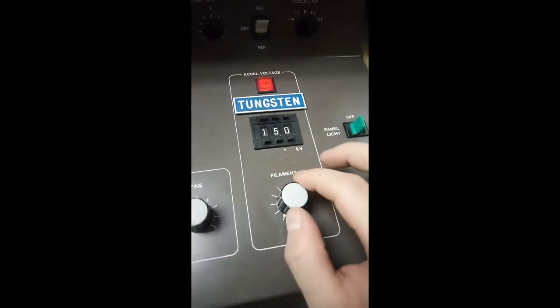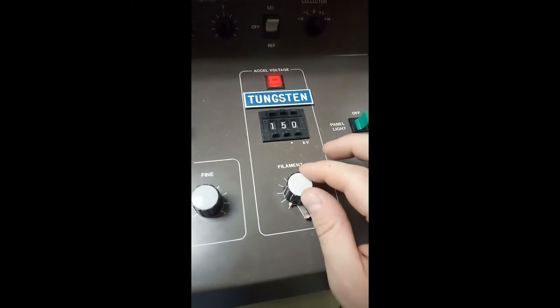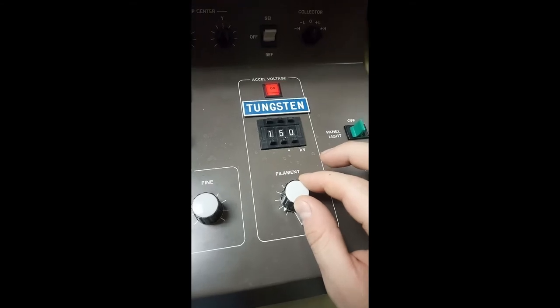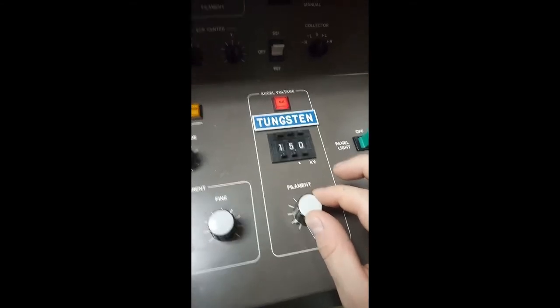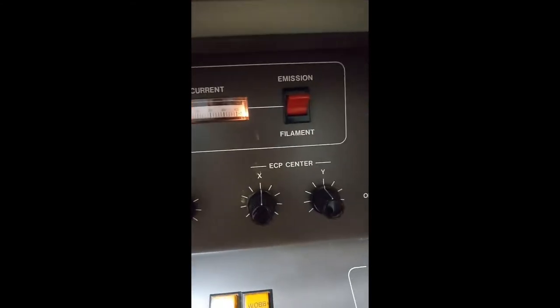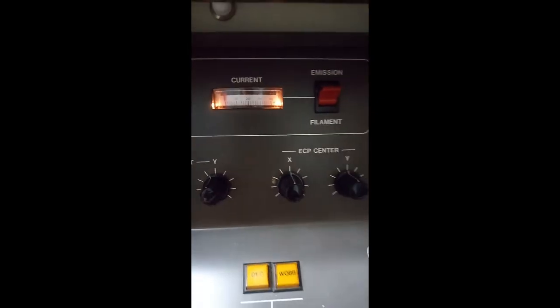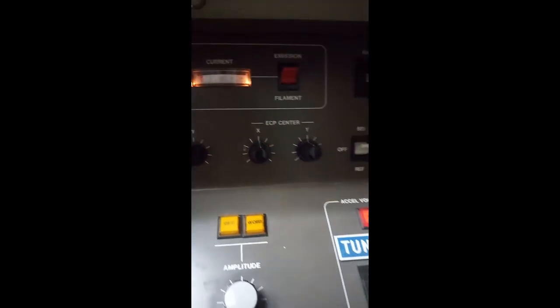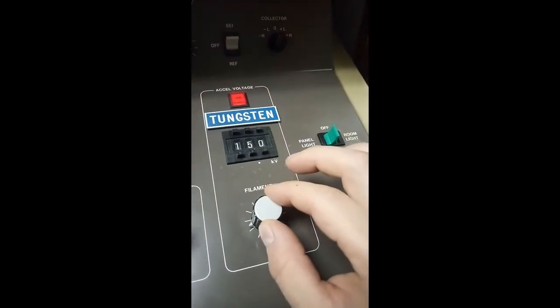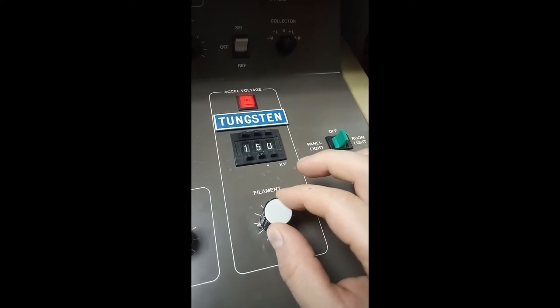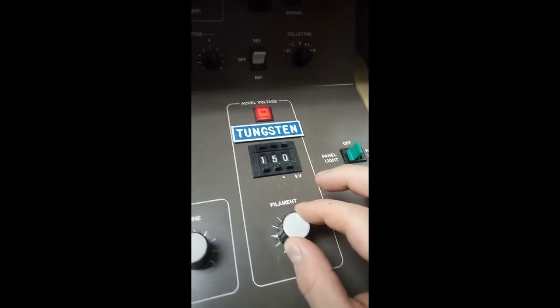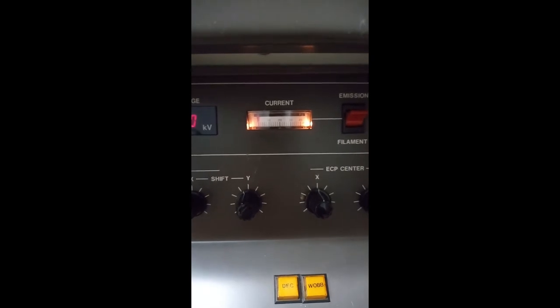When adjusting the filament knob, you want to go very slowly, bringing it up. On the meter, because it is set to emission and not filament, we are not going to see anything happen just yet. Right around 1 o'clock, as soon as we get to about 1 o'clock, we will see the meter start to rise a little bit.